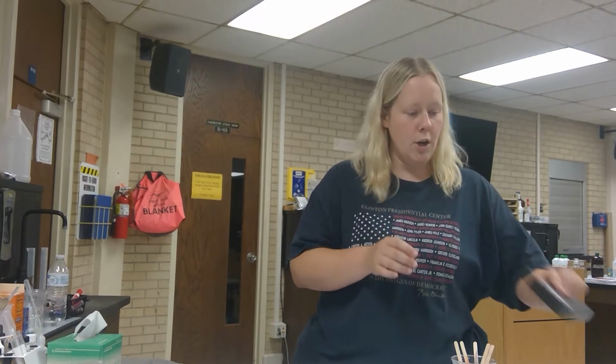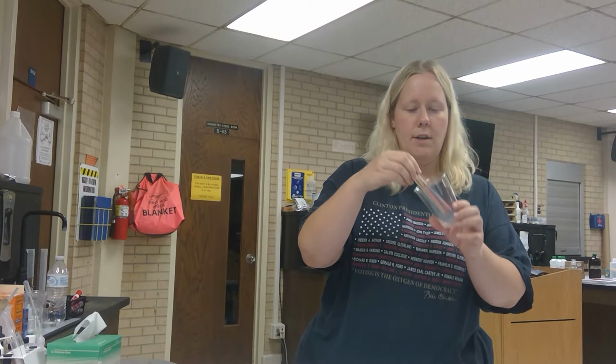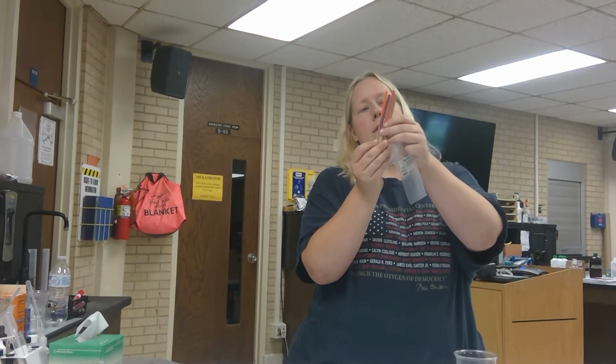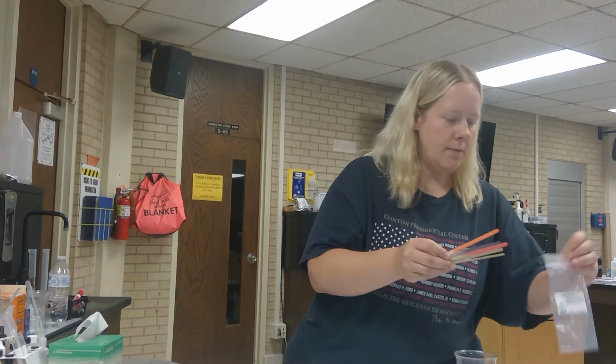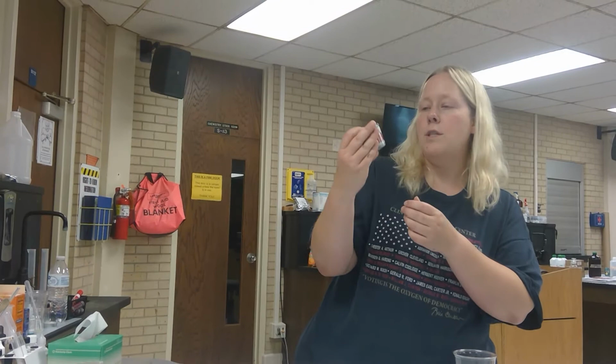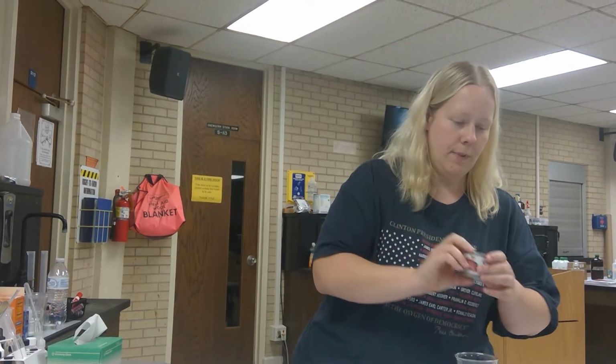You need the spectroscope, you need forceps, your cups, just one 10-ounce cup. You should have a package where it says flame test stick pack. You will see, it's like 5 sticks in here. Okay, so you have different colors. And you will have a flame source, so you'll have your ethanol gel.